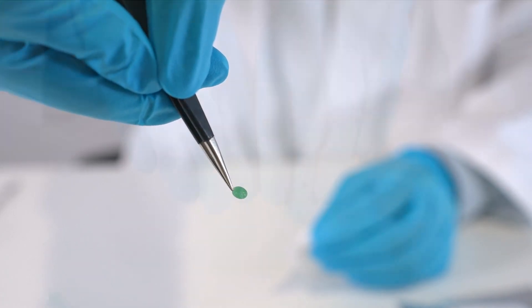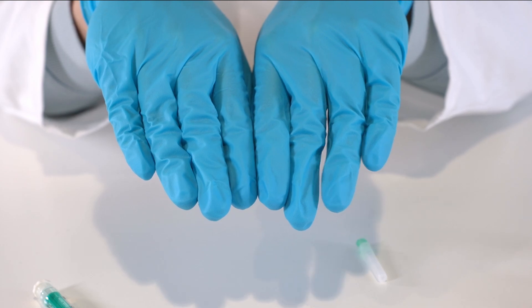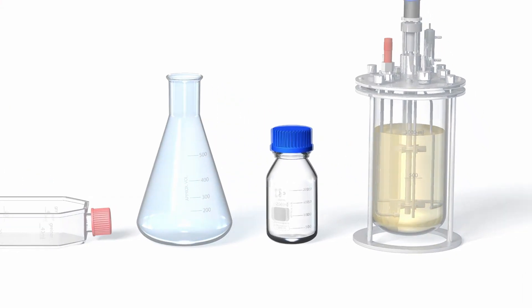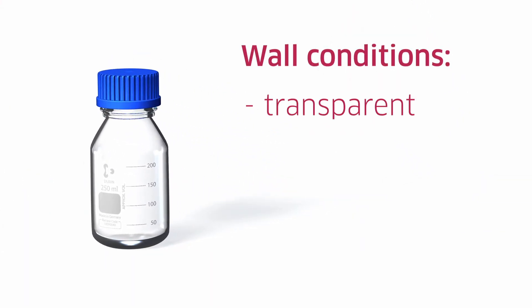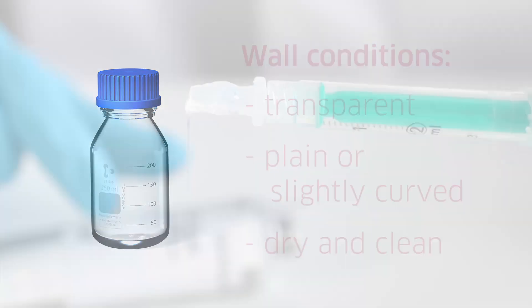Through the whole process gloves should be worn to protect the sensor spots and the quality of your measurements. Prepare the sample container of your choice. The wall should be transparent and the adhesion surface should be plain or only slightly curved. Ensure the surface is dry and clean for better mechanical stability of your glued sensor spot.